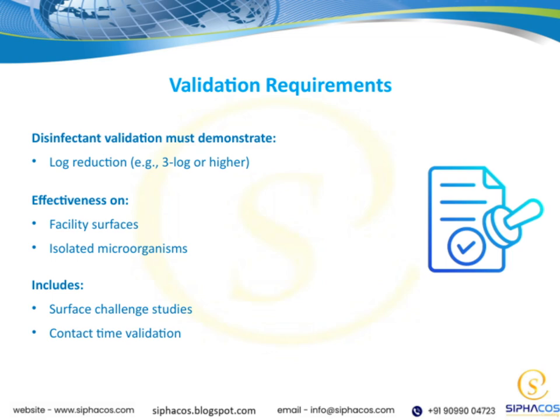The validation process includes surface challenge studies, where we test the disinfectant's ability to handle challenging microbial loads on actual surfaces. We also need to validate contact time, meaning we confirm the amount of time the disinfectant must be in contact with a surface to achieve the desired microbial reduction. All of these components together help us ensure that the disinfectant is both effective and reliable in maintaining a safe environment. This thorough validation process ultimately ties back to our overall goal: safeguarding health through proven disinfection practices.